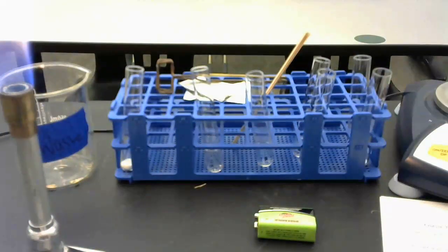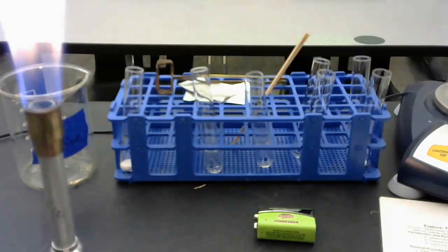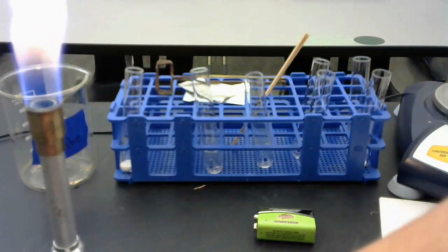Once I get that started, I'm going to adjust my oxygen a little bit so that I have more of a blue flame. Some of the Bunsen burners won't adjust very well, so try to get it to adjust the best that you can. This Bunsen burner that I'm using will not let me adjust the oxygen, so I'm going to use it as it is. I'm going to take my magnesium.